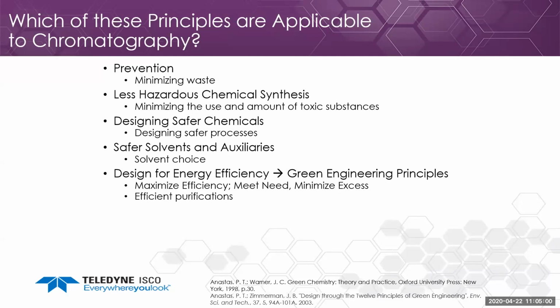Another principle from green engineering is design for energy efficiency. To maximize your efficiency, you meet your need and minimize your excess. This can be applied to our purifications as far as being efficient, so we're going to discuss this really in depth in regards to scaling.